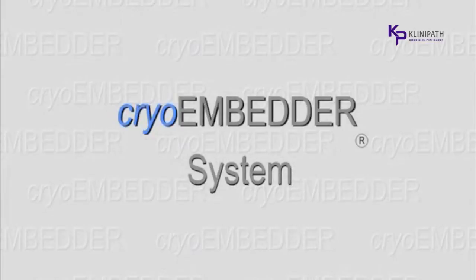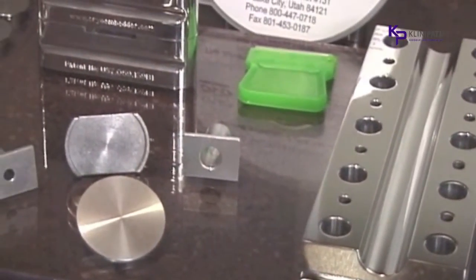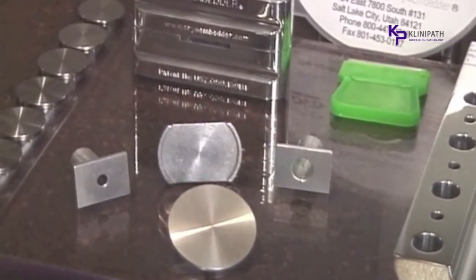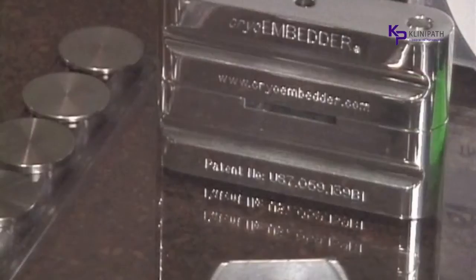The Cryoembedder System: a tested and proven method for preparing tissue for frozen sectioning. It consists of a cutting board, chuck holder, cryostat adapters, a trimming blade, flat embedding discs, an instructional CD, and the embedding device.